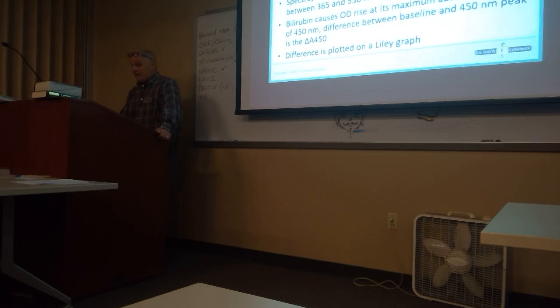Now I've got to talk about a test, and once again, I haven't done this test, but it does make sense. They will take a spectrophotometer and measure the absorbance or the optical density at a certain wavelength. You know when you guys use the spectrophotometers and you set it at a wavelength, right? It says spectrophotometric analysis of fluid optical density between 365 and 550 nanometers is plotted on semi-log paper.